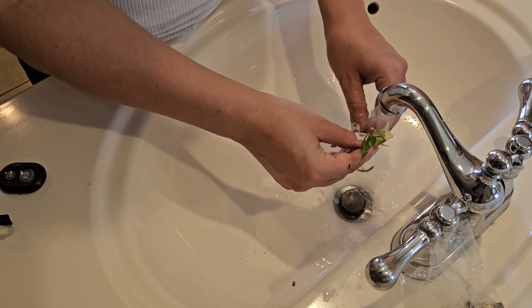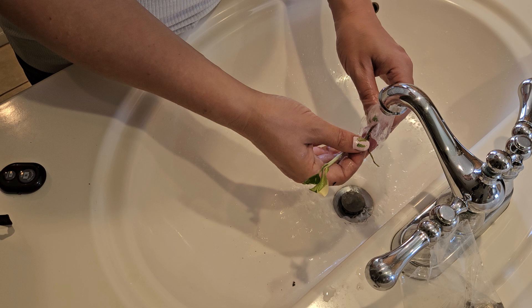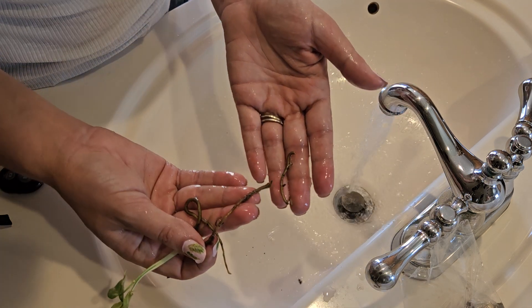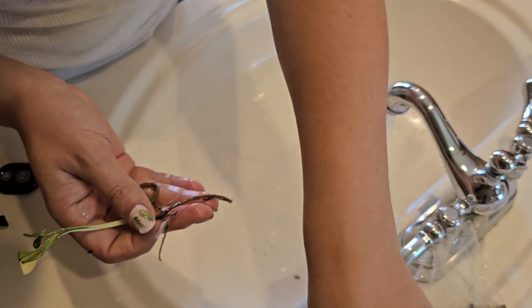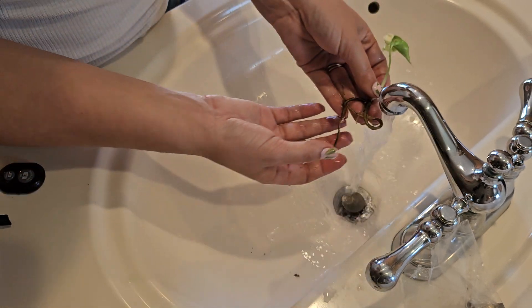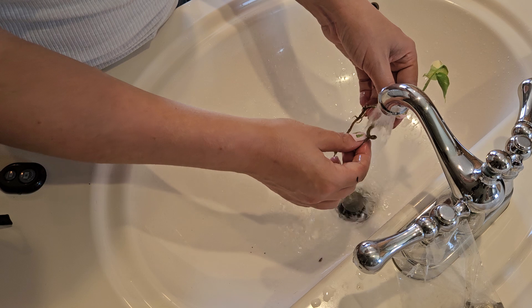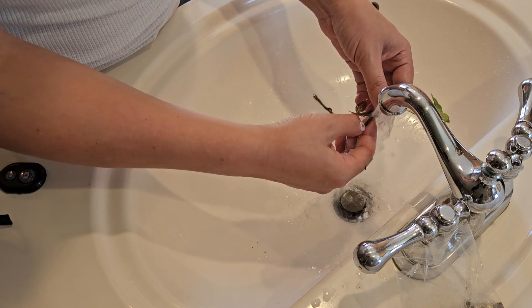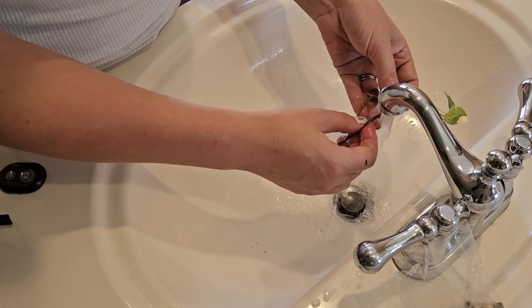A lot of people will soak them — put them in a jar of water, which is totally fine. And I think this is a great example: I just accidentally broke off a little piece of the root while I was rinsing it. That's okay. These are so thoroughly rooted and they root so unbelievably easy that it's not going to harm the plant if you break off just a little bit of the roots while you're cleaning it. It's definitely more important to get off all of the agar gel than to worry about breaking a root or two.